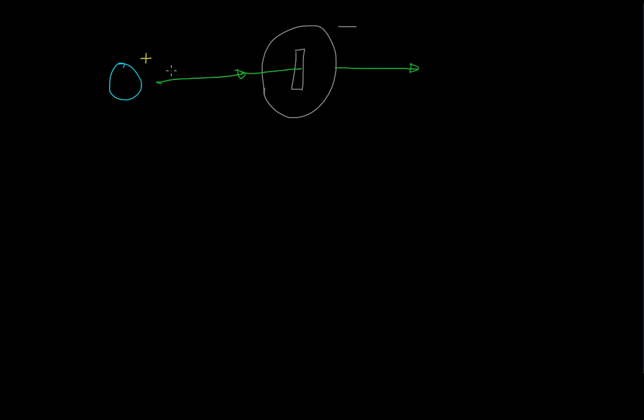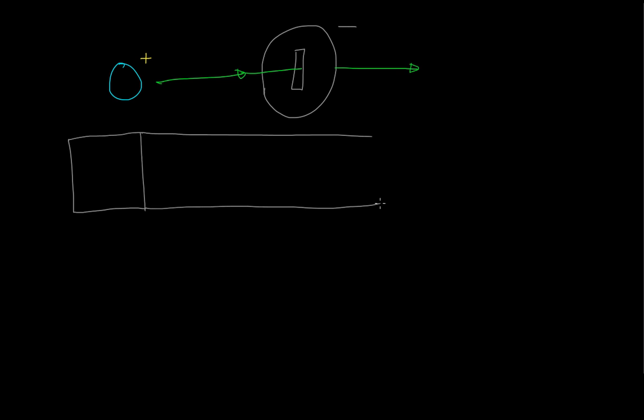So what we've essentially done up to this point is we've taken a molecule, we've ionized it, and then we've accelerated it to extreme speeds in a very narrow line. So if you imagine the tube where you've ionized it, the ionization center, and then it's coming out into the acceleration chamber. This is the ionization. This is acceleration. When we accelerate it to these 2 points, let's say, these green lines represent these gates.